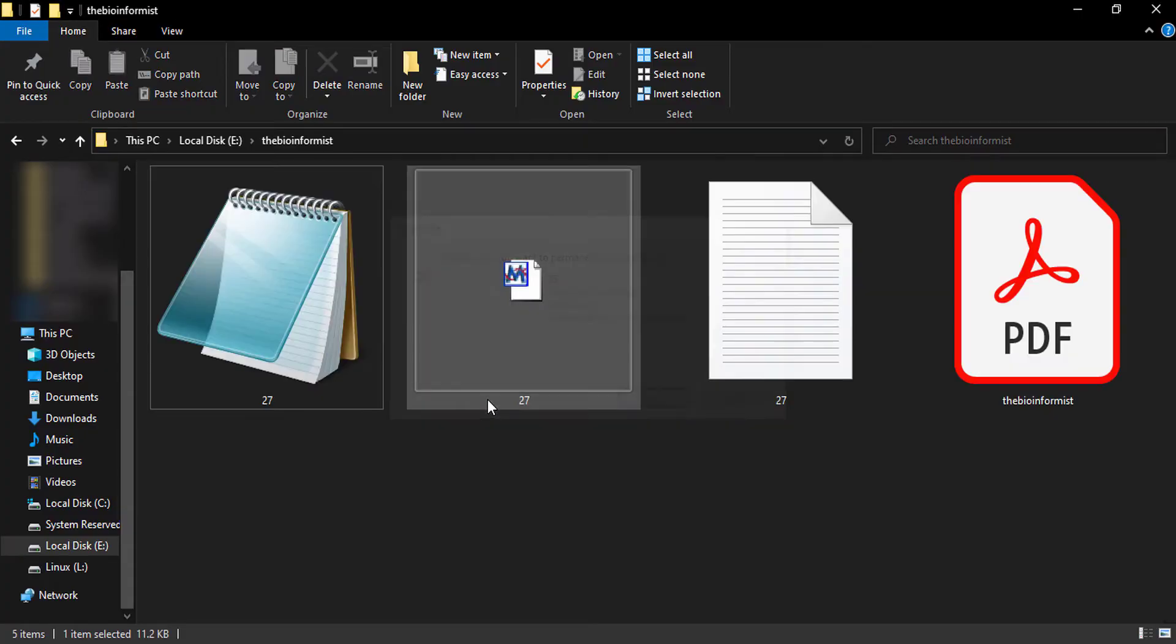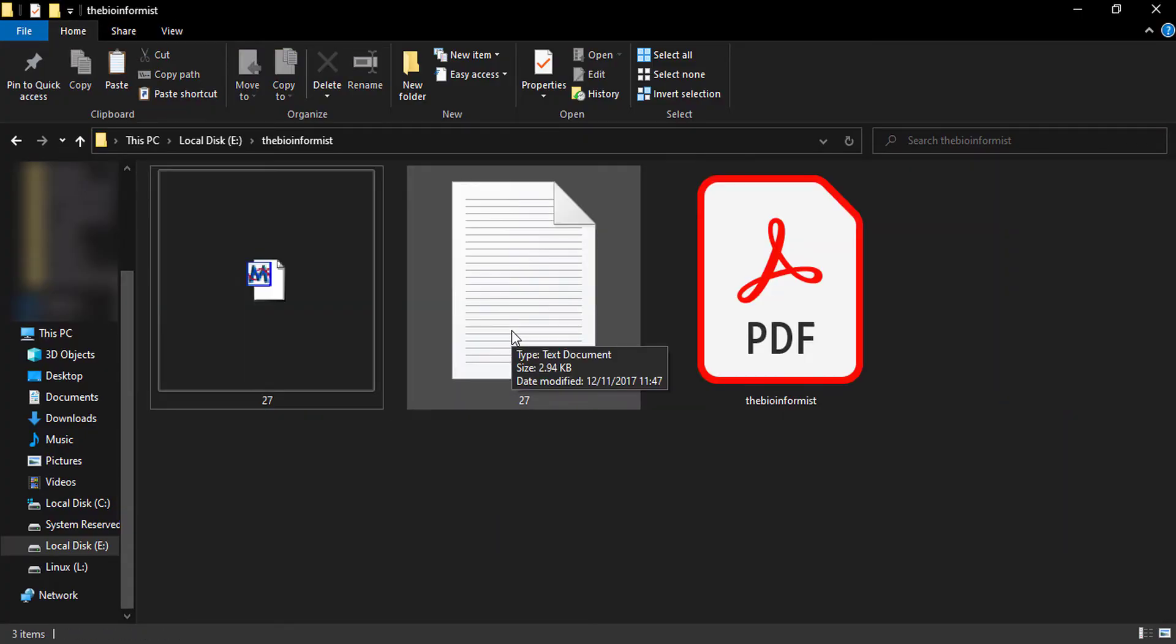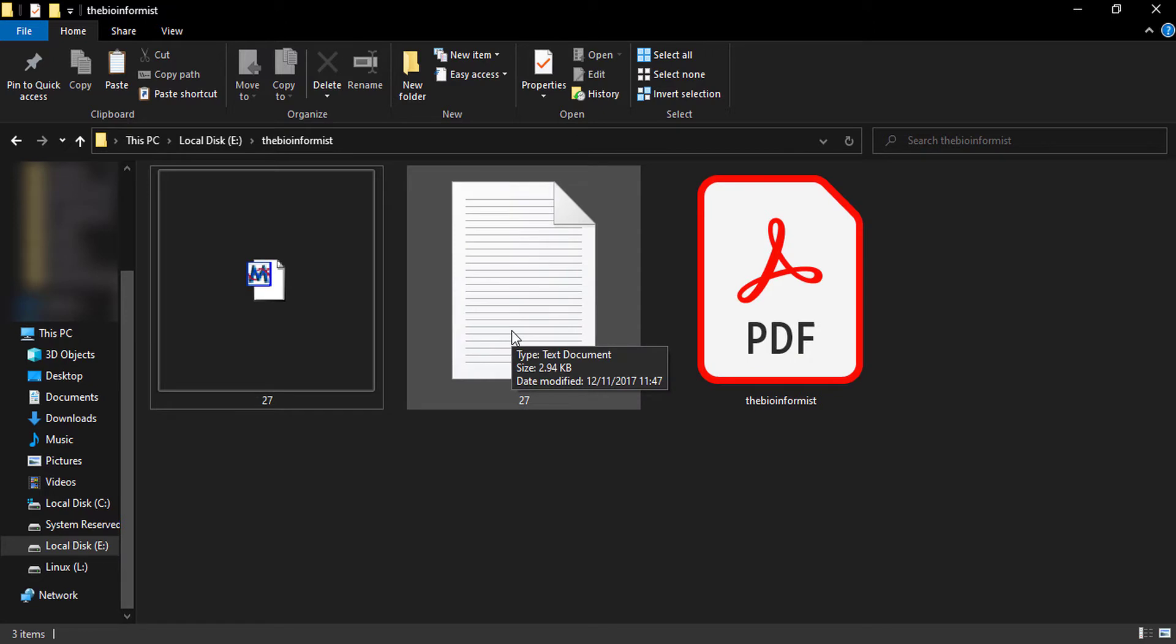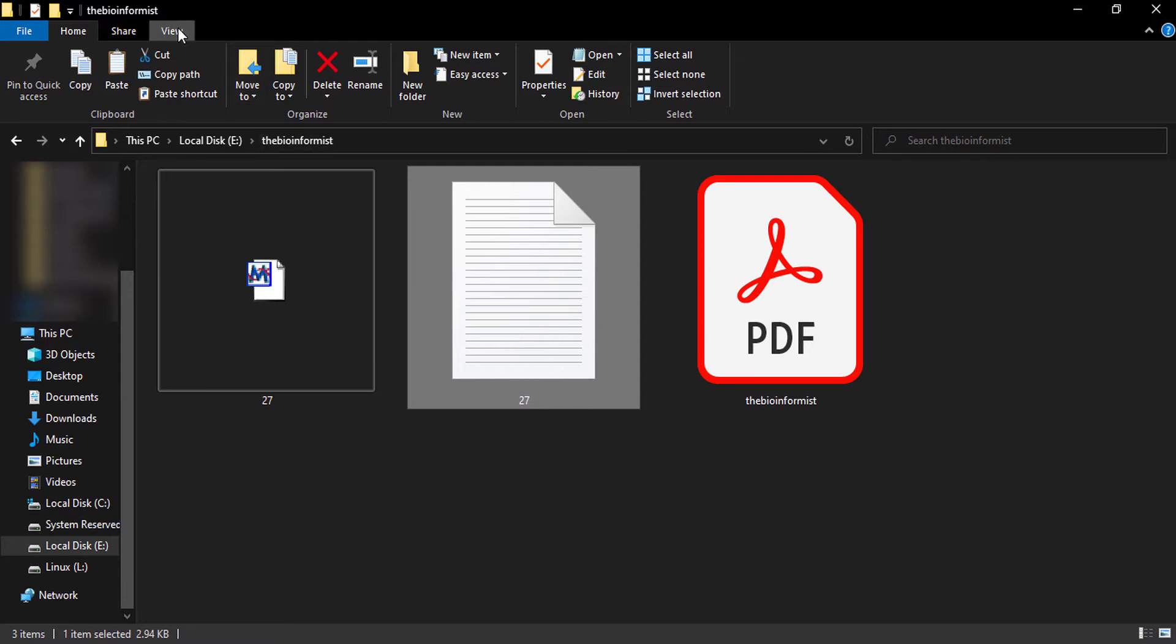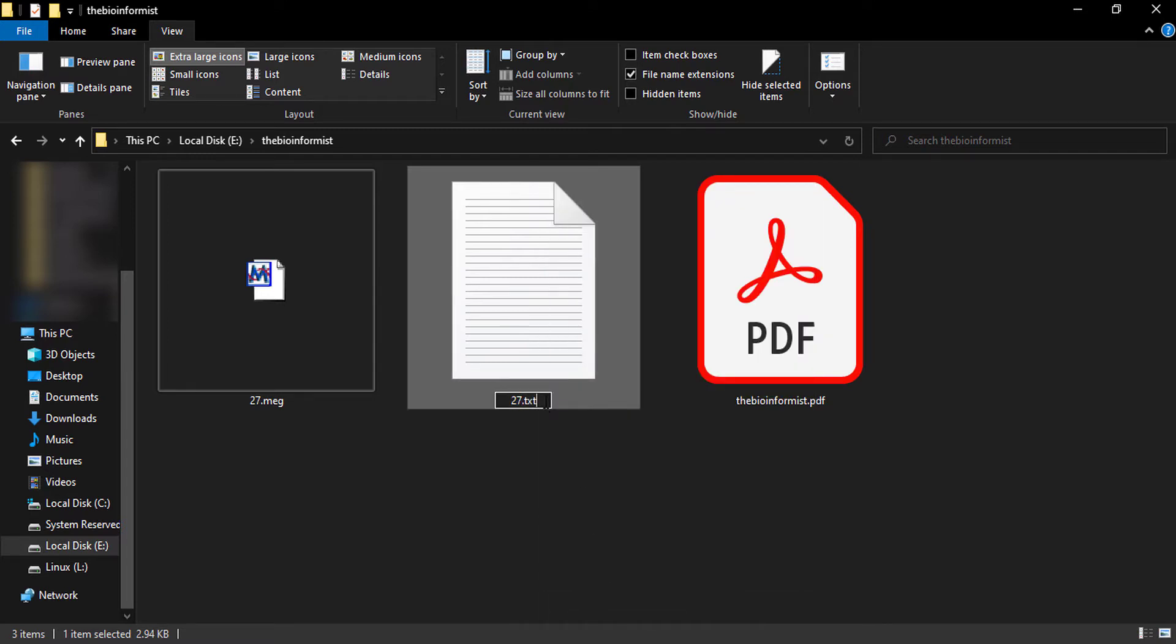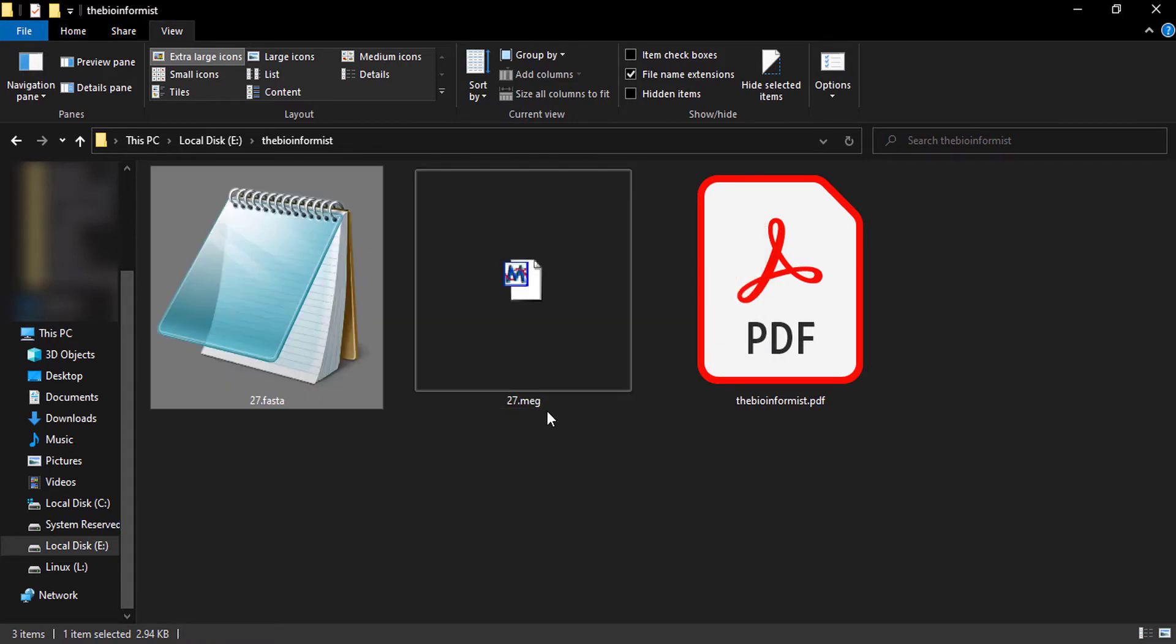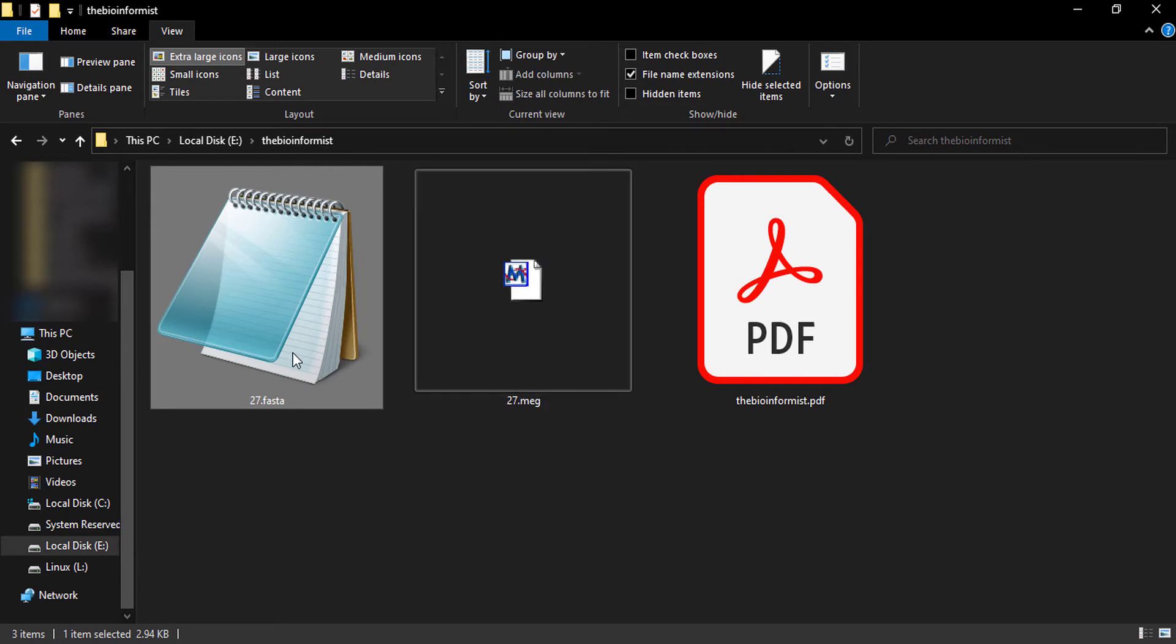This 27 file is what we're using to construct a phylogenetic tree. When we paste a sequence in a text document, dot text file is generic, but we need to convert it into FASTA format. There are different methods to convert it into FASTA format. The easiest method is by enabling the file name extension and then renaming it by removing dot txt and adding dot fasta. This will automatically convert the text file into FASTA format.